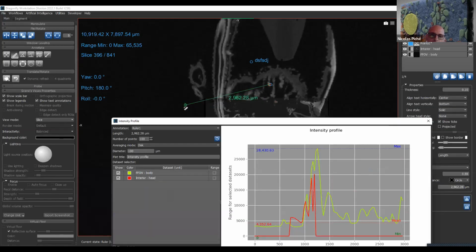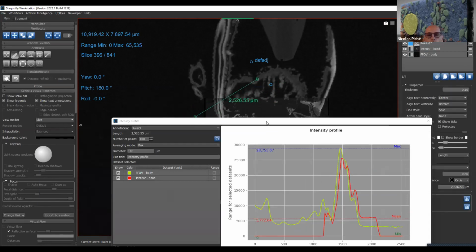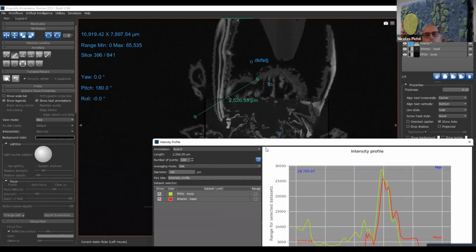So the ruler is quite a good tool to introspect a bit about the data, to understand what we're doing and what the shape of the edge of the data set is. Often you should not believe your eyes. We have a lot of neurons doing adaptive contrast enhancement in our eyes. I have multiple examples of data sets where you think a region is brighter than another one, but in fact it's totally wrong, and it's built into our brain. We cannot turn it off.